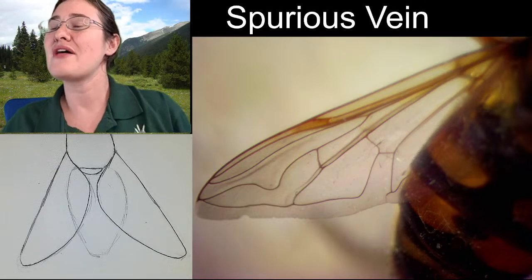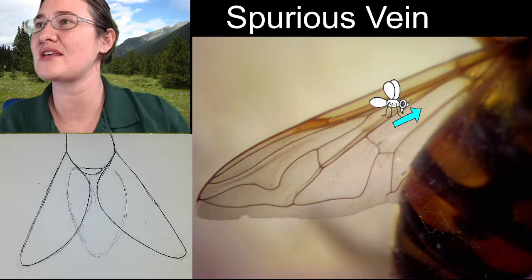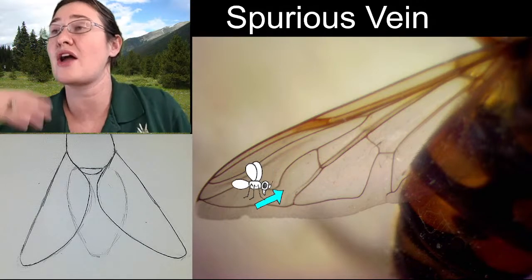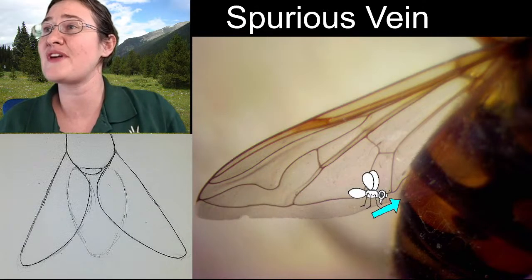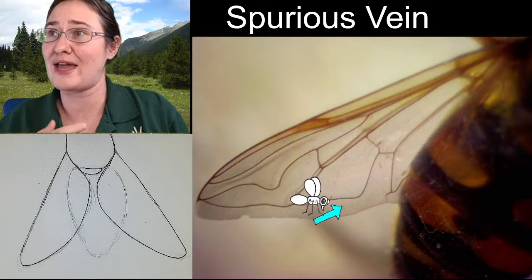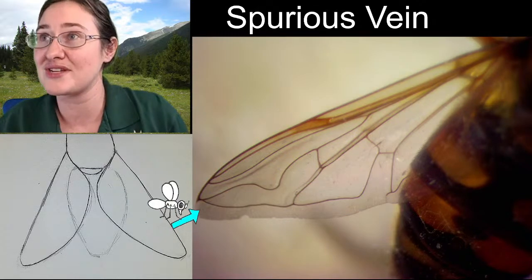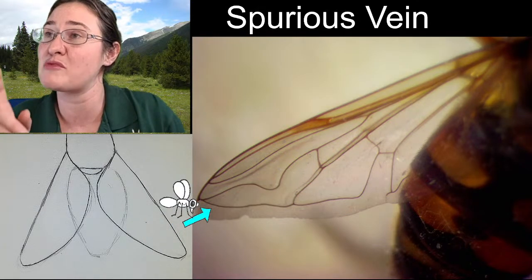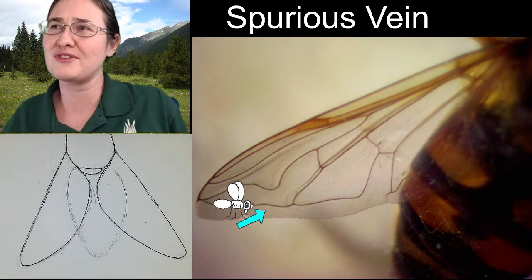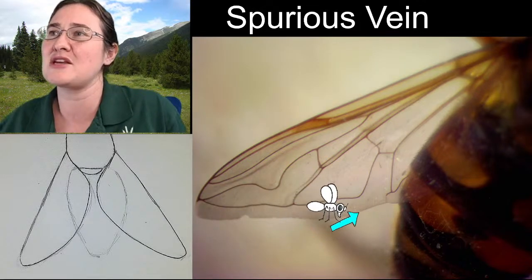All right, so there are a couple of veins here. You can see there are all types of veins happening in here. Some things that I notice when I'm looking at an insect wing: these veins on the edge, the veins of the wing never reach the edge of the wing. That's not going to be a defining characteristic or anything. It's not going to help us get to family, but it's always interesting and it's always one of the first things I notice about wing venation, because there are some families where that's going to be one of your big cues.